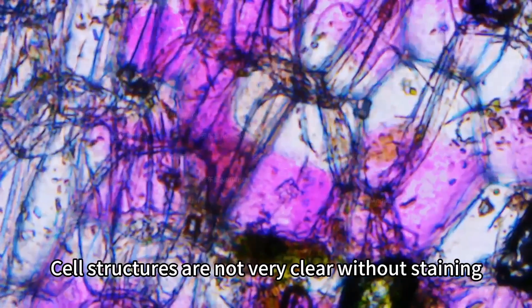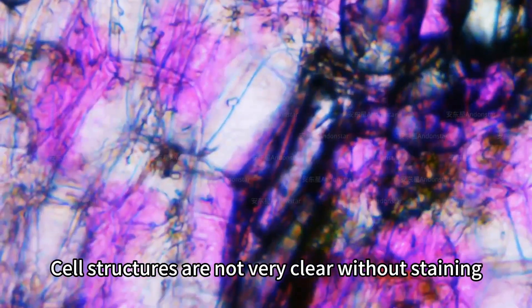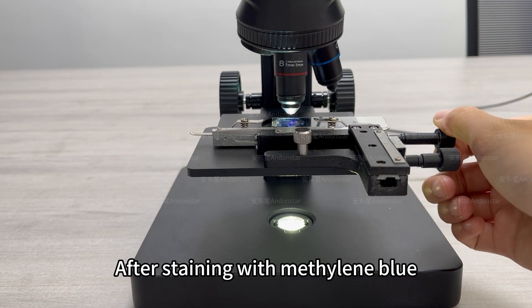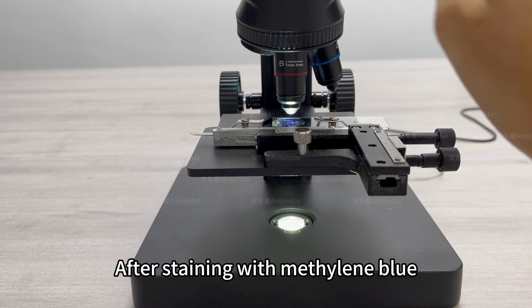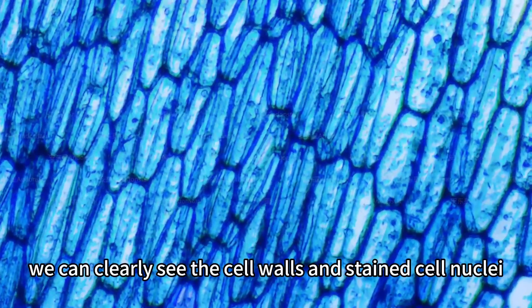Cell structures are not very clear without staining. After staining with methylene blue, we can clearly see the cell walls and stained cell nuclei.